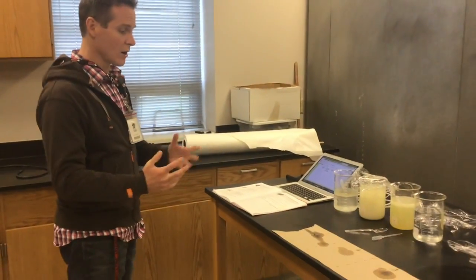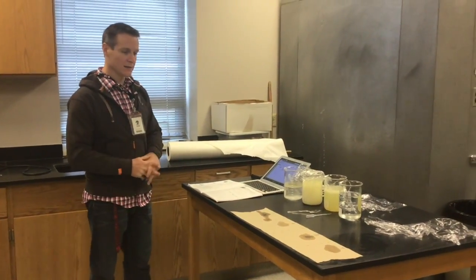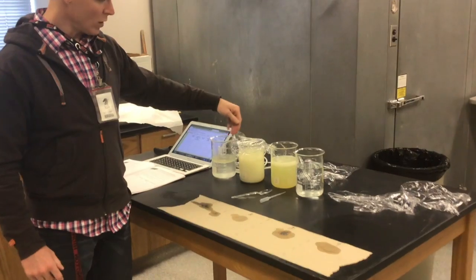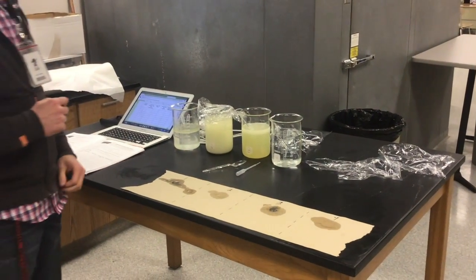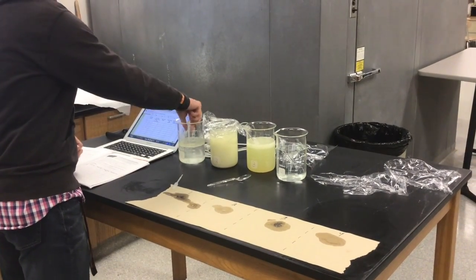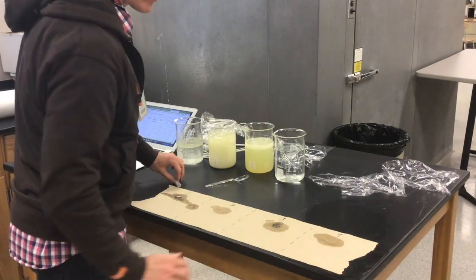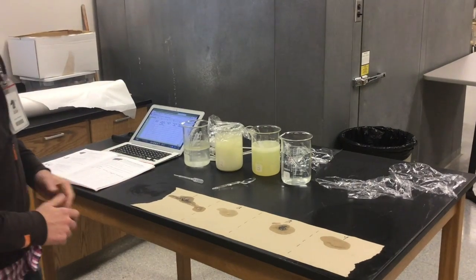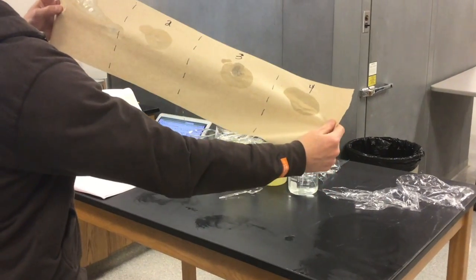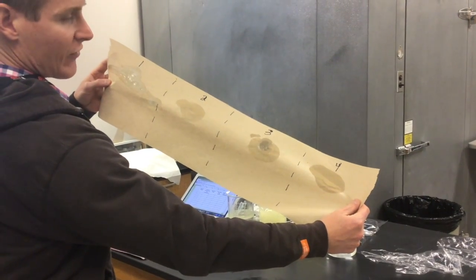Okay, so we're going to start with the first test, and that's going to be the brown paper test, and we're going to see if we can find out if lipids are present in unknown 1, 2, 3, and 4. So what I did is I took my pipette and sampled each unknown, and I put a little drop onto this piece of brown paper. We're going to let this dry, and you can see right now unknown samples 1, 2, 3, and 4 have been put on there. We're going to let that sit for probably about 5-10 minutes.